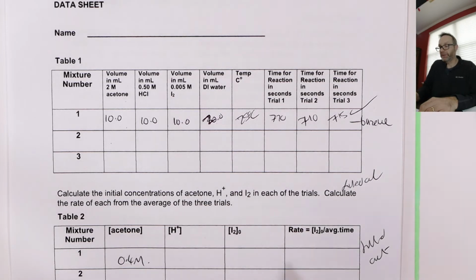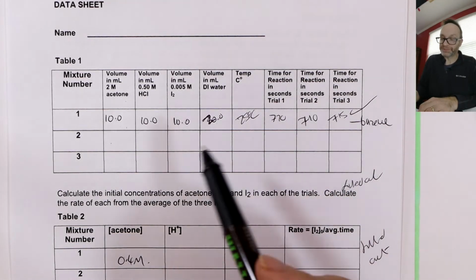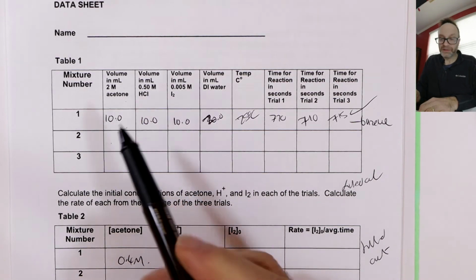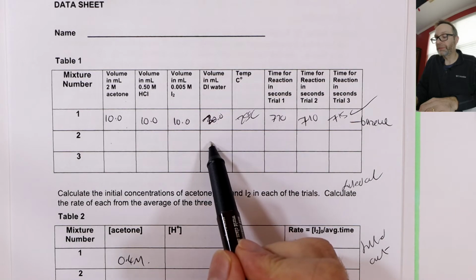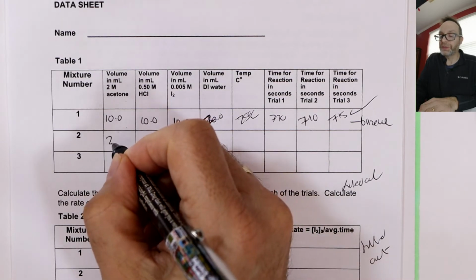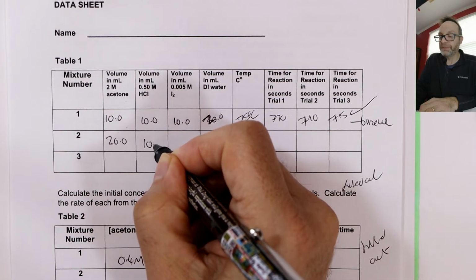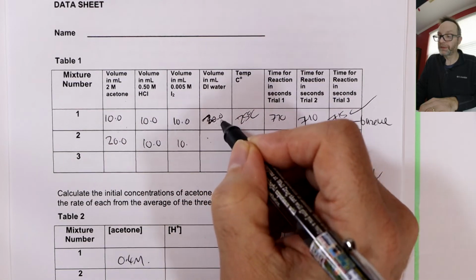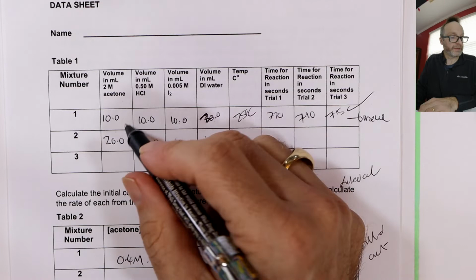And then to find out the rate, which we'll do down here, it's just the concentration of iodine divided by the average time the reaction took, all right? But anyway, you've got to set it up first, right? So here, what we're going to do, in the next one, remember, it's all going to add up to 50, right? So I'm going to use twice as much of this, same, and 10 less water, yeah. So that's actually 30, 40, 50.